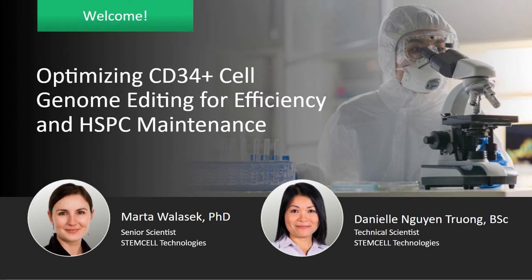We're very fortunate to have Dr. Marta Walasek and Danielle Truong from Stem Cell Technologies here with us, who will be providing tips to lock down effective genome editing conditions for CD34 positive cells, methods to evaluate genome editing efficiency, and optimal culture conditions to maintain stem cell function and long-term editing effects.